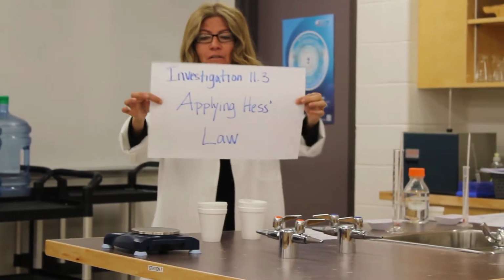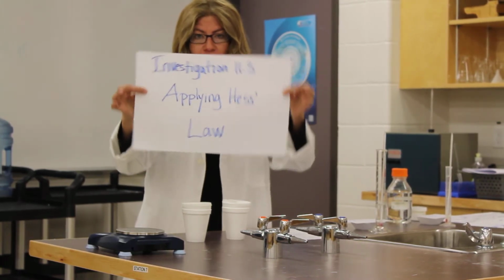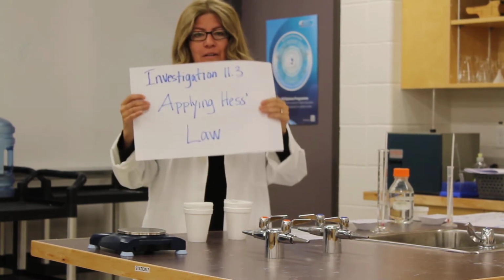So today we're going to do investigation 11.3, applying Hess's law. And we're going to use the concept of Hess's law, and our friend the calorimeter, in order to figure things out.